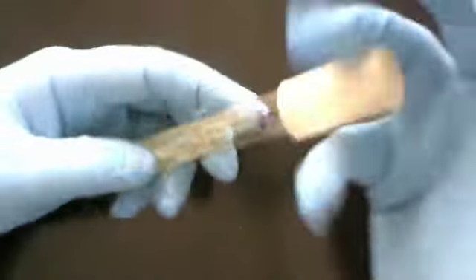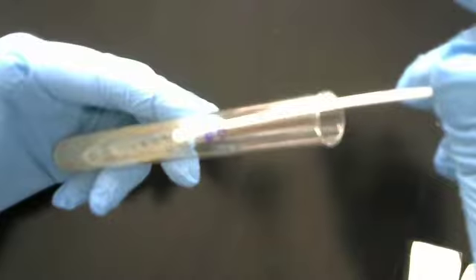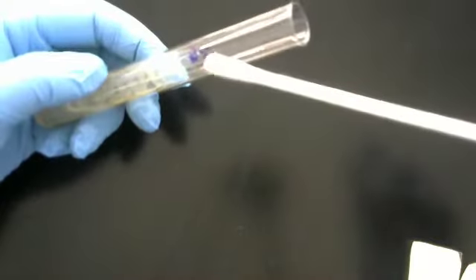The next test we're going to look at is the oxidase test. This is whether or not cytochrome oxidase C, in this case, is produced by the bacteria. So we're actually going to start off with a swab, and we are going to take a swabbing of our bacteria, making sure that there is bacteria on the swab.